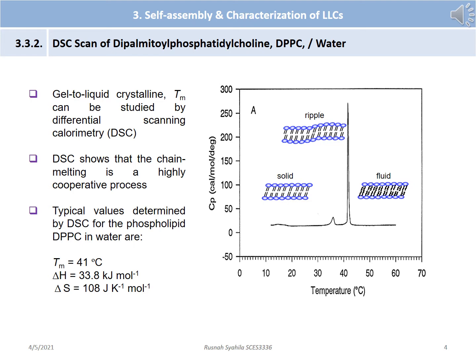The first transition, with small enthalpy change, occurs at 36 degrees Celsius and is the transition of solid DPPC to ripple layers. This kind of transition doesn't require much energy. The second transition belongs to the gel to liquid crystalline transition. Larger energy is required for this transition, for melting the chain to make it a fluid layer, which is the lamellar phase.